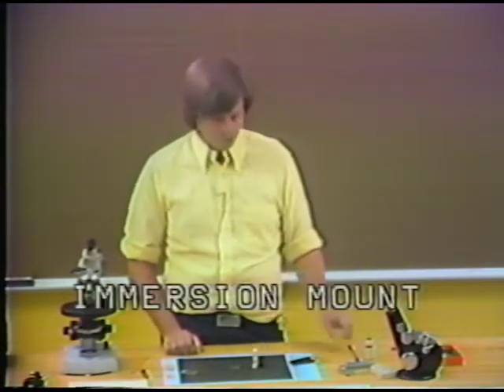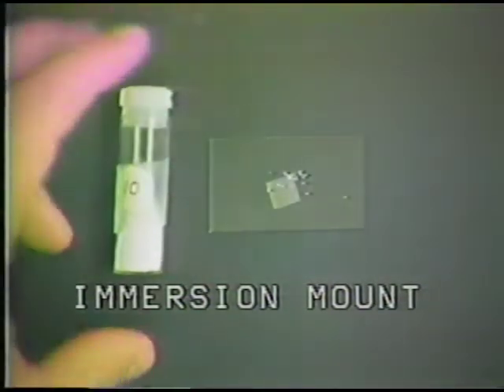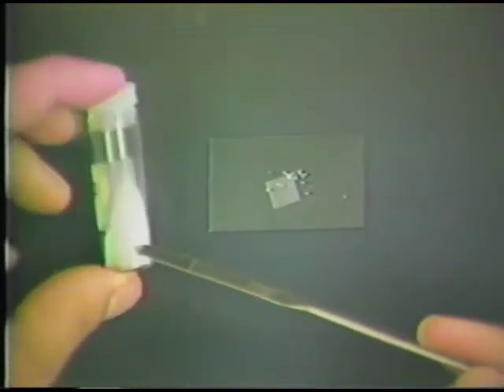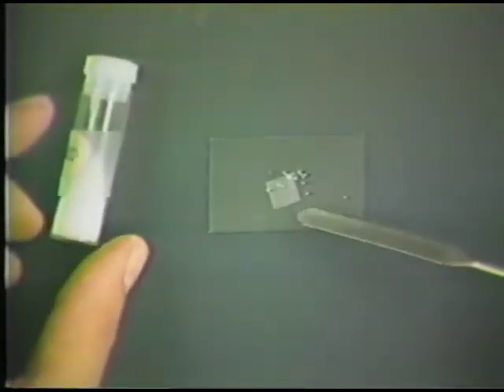And I have the materials to prepare an immersion mount here. There's a sample here which is a very finely ground powder of a mineral grain, and I can use this spatula to extract some of these mineral grains, as you can see that I've done.